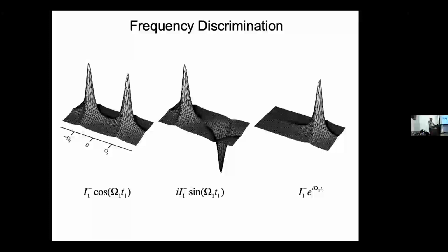To tell which direction the wheel is rotating, you have to have two spots 90 degrees apart from each other. And that's called quadrature detection, because you're measuring in quadrature to tell the direction of rotation of a shaft, of an axle. And so this is called quadrature detection in NMR for the same reason.